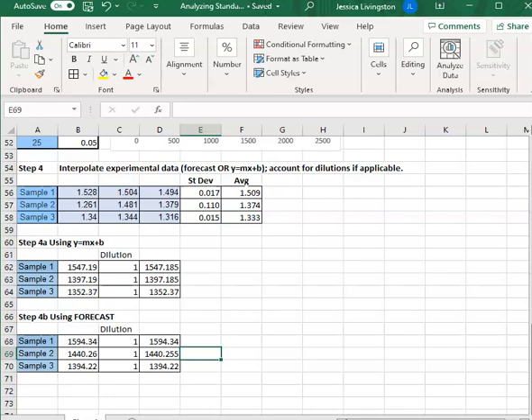So number one, make sure you use an appropriate method for your data set. Like I said, you can read about the pros and cons of each of these methods and decide what's best for you and your data set. It is most important that the replicate data that you're using is reliable and accurate. So again, make sure that you actually do check your standard deviations of those triplicates. There's a reason that we do triplicate. If there's something strange about one of your replicates, we can discuss what to do with it, whether you want to exclude it, and that kind of thing.